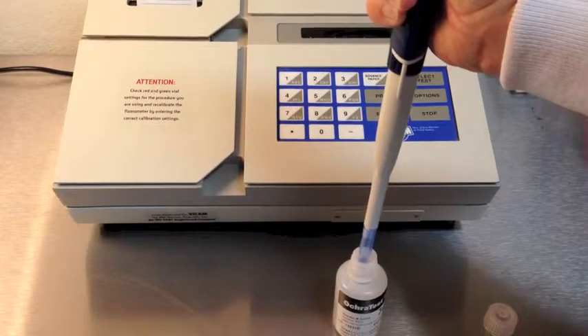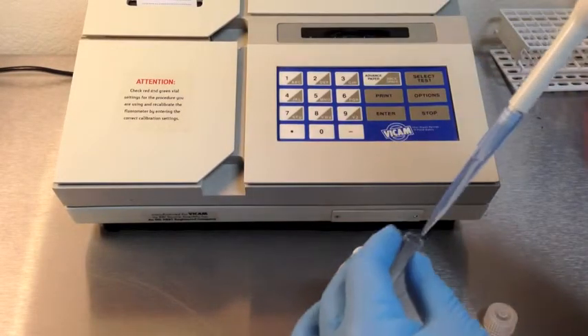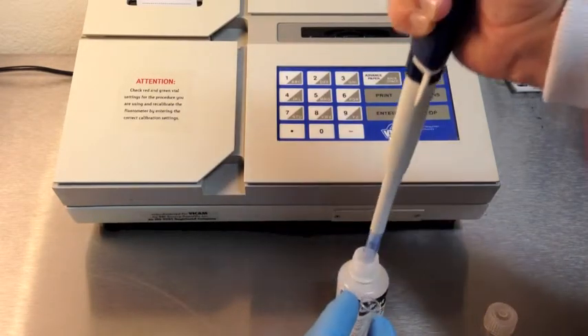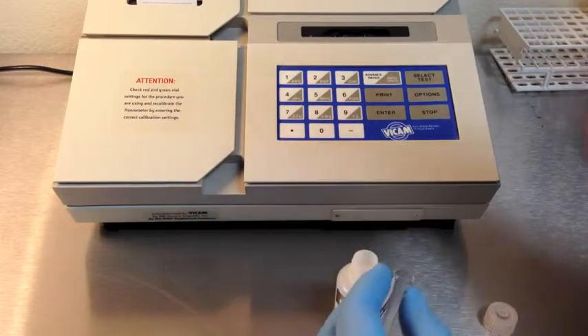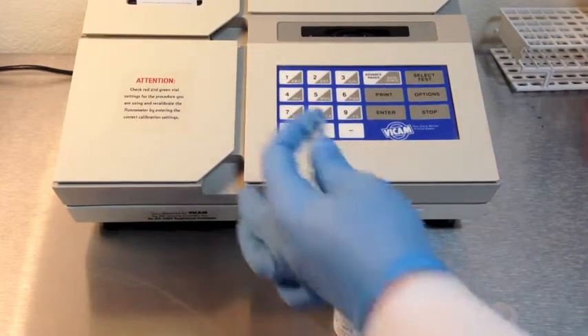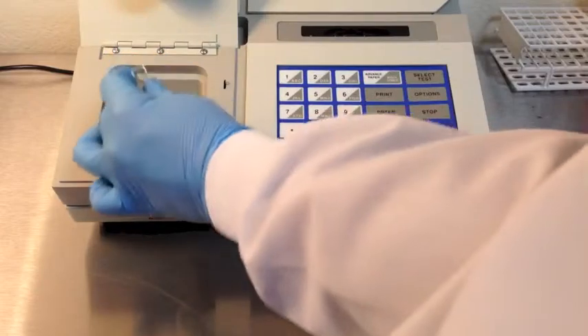OchraTest Elution Solution comes premixed from Vicam. Test the Elution Solution with 1.5 milliliters of solution in a clean cuvette. The result of this test must be zero. If not, replace the Elution Solution with a new bottle.